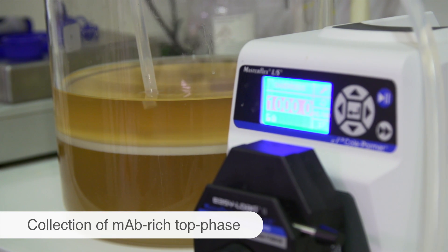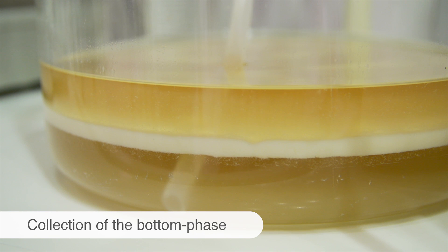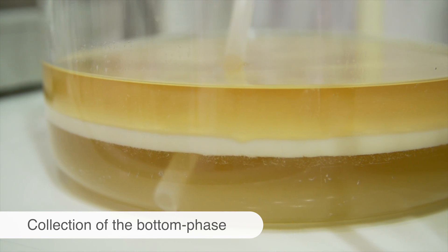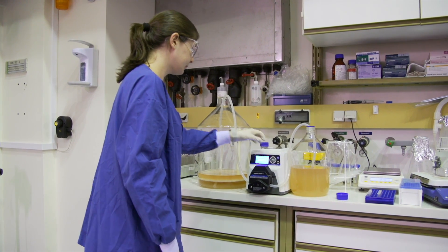Thus, it was shown that aqueous two-phase systems using LITEQ-Z can be an alternative chromatography technique for industries and laboratories, due to their simplicity and high versatility in scaling up protein purification processes.